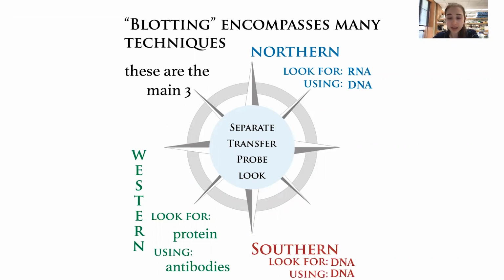So with PCR, we can basically make copies of specific sequences using sequences that are specific for those. But there are still reasons why, in some cases, we will still use northern and southern blotting, because we can get different types of information that we couldn't get with PCR. And so we'll get more into those in them. And I just want you to know that these still are techniques that are used, even if they're not used as frequently as they were in the past. And we'll also talk about some of their past uses, which are really important in pioneering genetic studies.